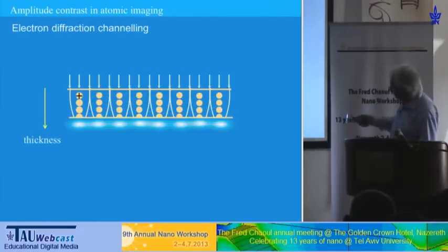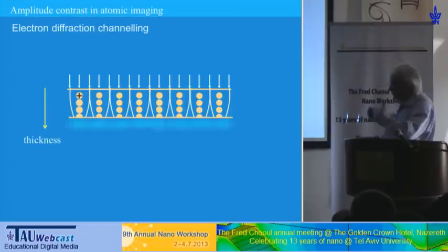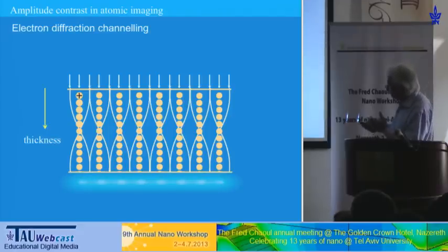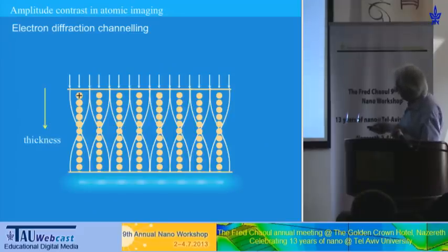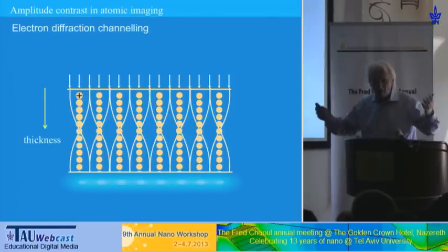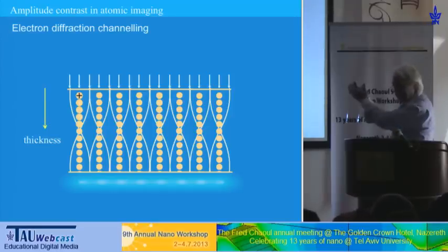And then the electrons get accelerated towards the positive atomic strings. And they get localized there in certain thickness values, certain depth values, and then they fan out again because the core of the atoms is so small they never meet the atomic core directly. And then that's what you get. You get an oscillatory motion of the electrons. That's the Bloch states. We are so often learning about Bloch states in our lectures at university, but this is the behavior of Bloch states.